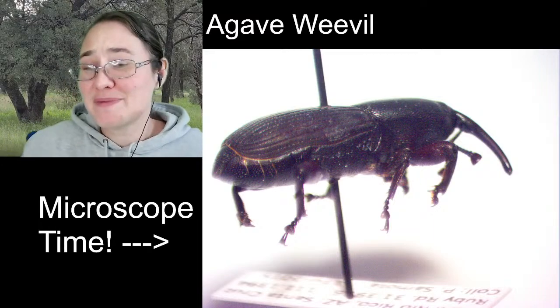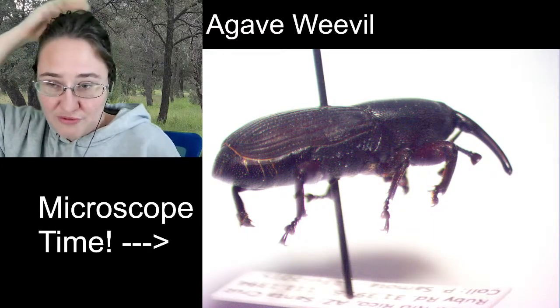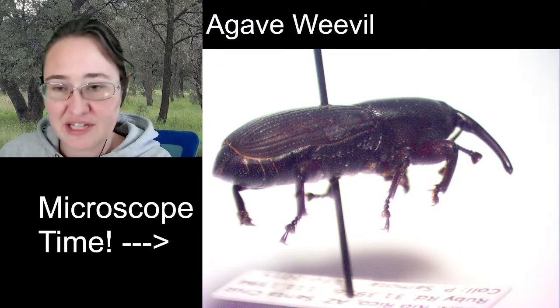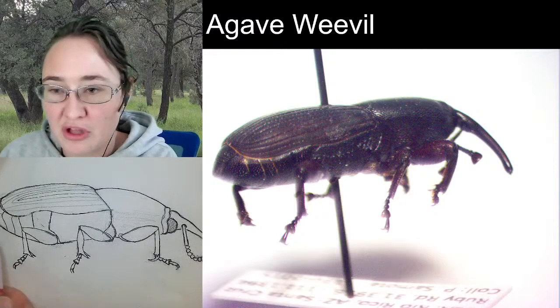I'm saying he, but honestly, I'm not sure if this weevil is male or female. I'm not exactly sure how to tell that on weevils. I would assume it has something to do with the terminal abdominal segment.